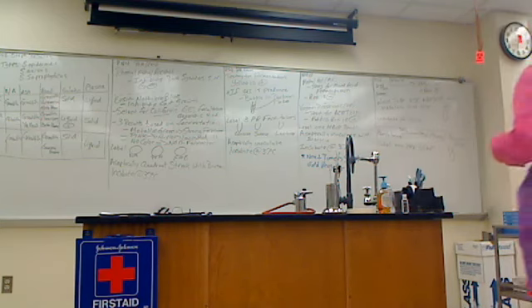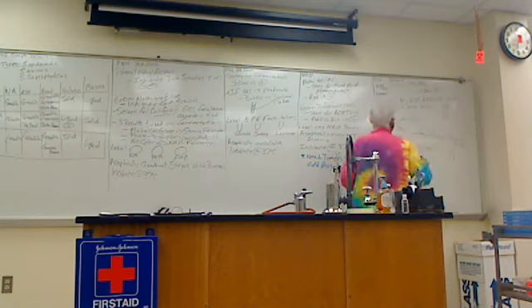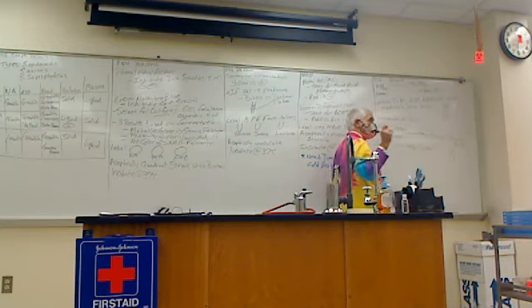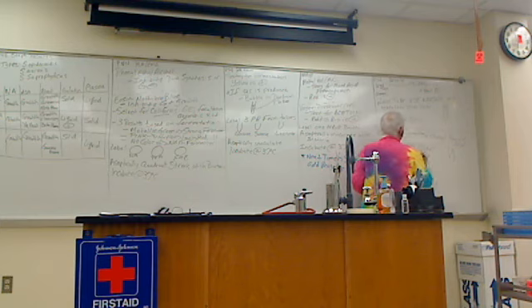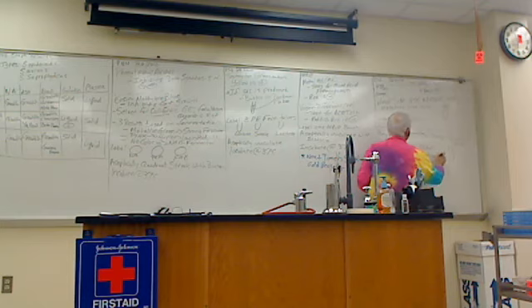So you're going to inoculate this one by doing what we call a fishtail, okay? So aseptically, fishtail streak PAD slant.